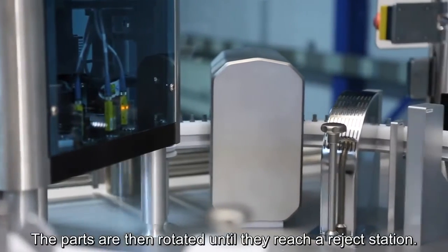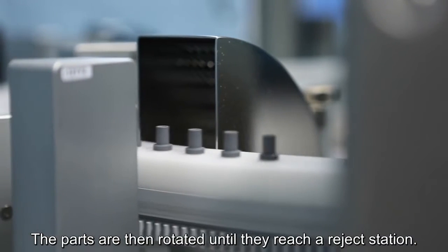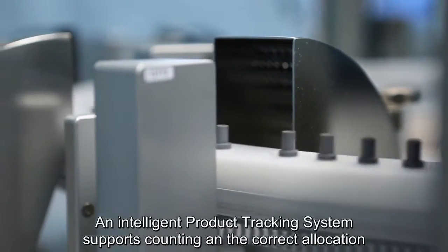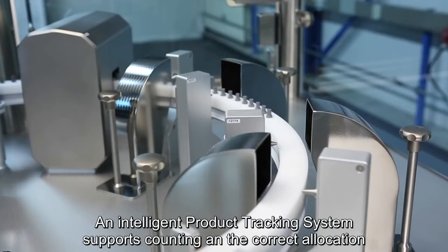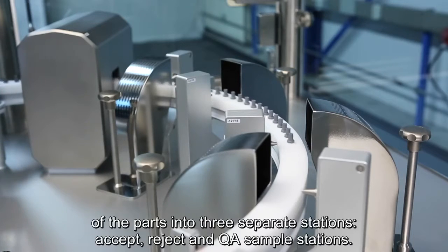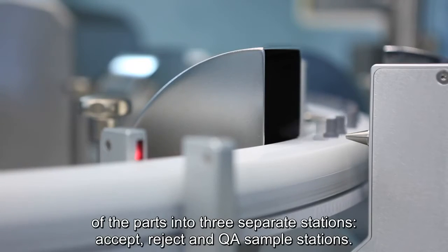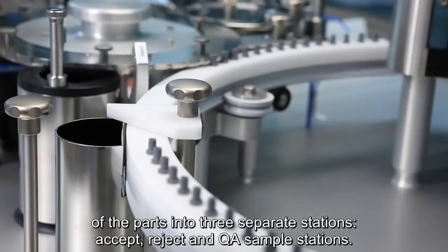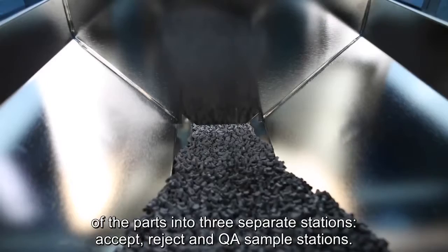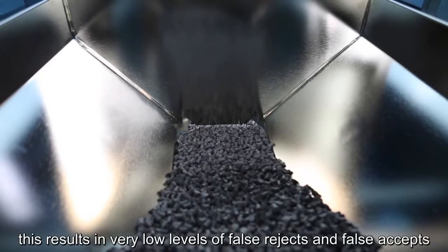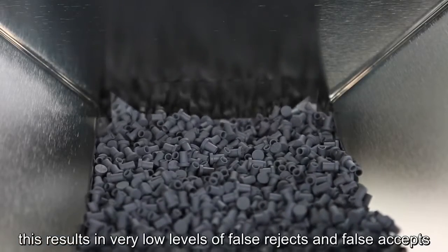The parts are then rotated until they reach a reject station. An intelligent product tracking system supports counting and the correct allocation of the parts into three separate stations: accept, reject, and QA sample stations. This results in a false acceptance of less than three products per million.